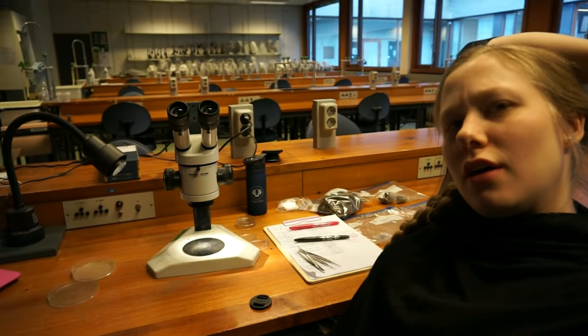I'm being an exciting person today. No, I'm not. It's Saturday, and I'm in the lab — in my muffin lab — and I'm fixing my bryophytes.